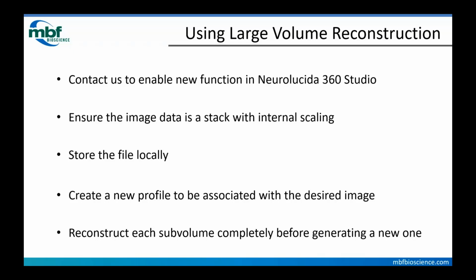Because this is complicated, large data, we have found that this is something that you go back to, and it's not something you finish in a single session. You'll come back to it multiple times. And so creating a profile to be associated with the desired image really streamlines that process of being able to resume work with this particular large data set.